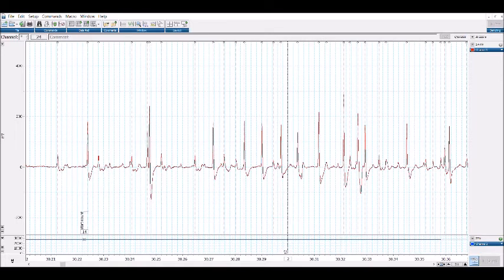And you're going to right click and type add comment and then start count, which I had already done here. And then you're going to take this button over here, this marker, and drag it to the bottom channel, channel 2, where the start marker is, the start count comment. And then it's going to count all these spikes.